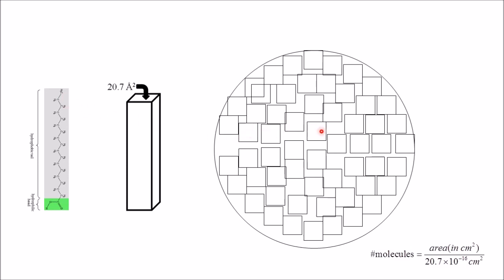And they'll kind of line up like this and fill up and fill up and fill up. And when the last spot is filled up on this circle, then the next time you put a drop of this stearic acid solution in, it suddenly can't go anywhere, and it's going to form sort of like an oil slick on top here. It's pretty neat. It's kind of neat to watch.